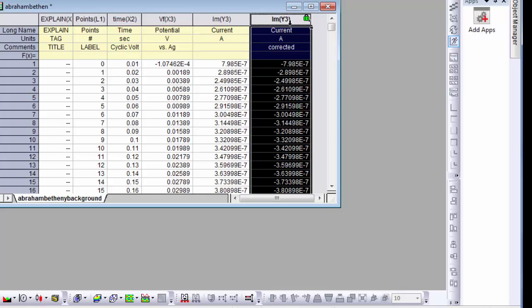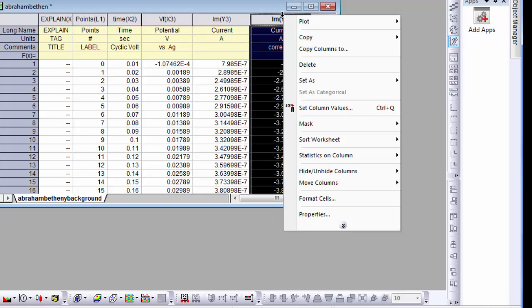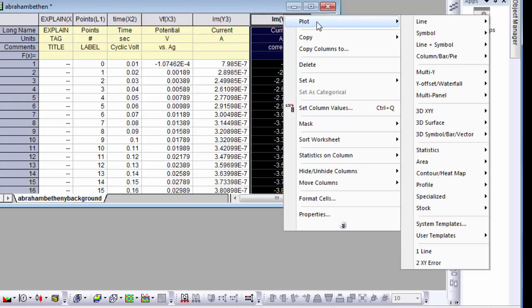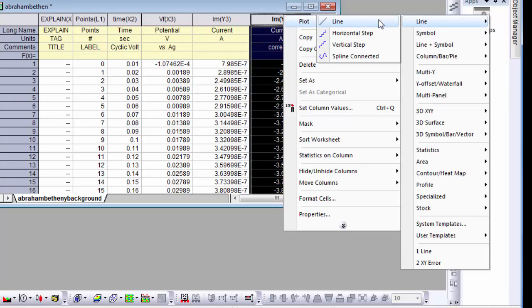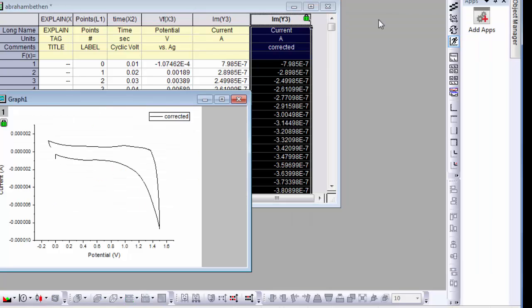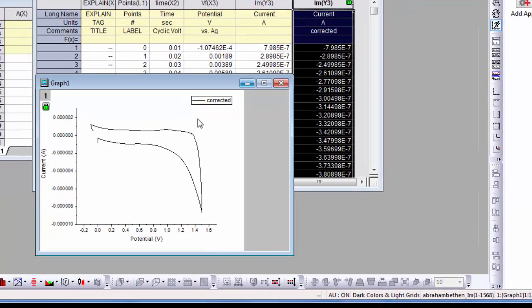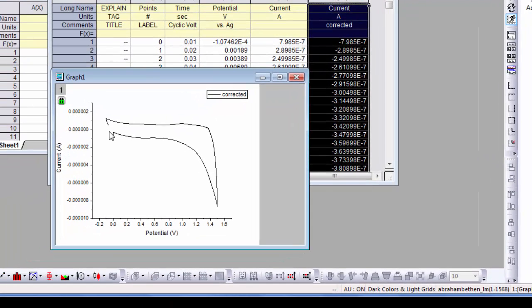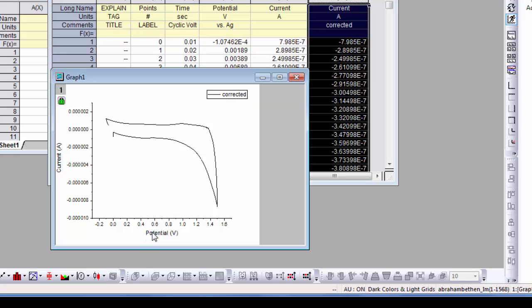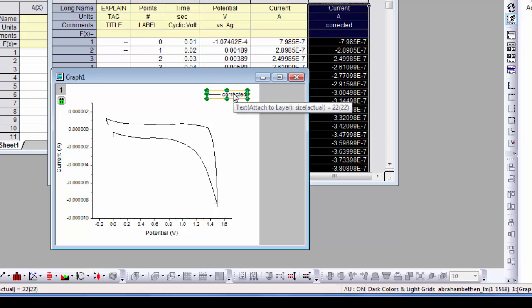Now we want to plot this versus our X value. Make a plot, a line plot. And there we go. We start at zero, we went to positive 1.5 and then went back to zero. Current versus potential with the units. That's correct, except that by convention, positive voltages are supposed to be displayed on the left. So let's fix this graph first. We don't want the legend.